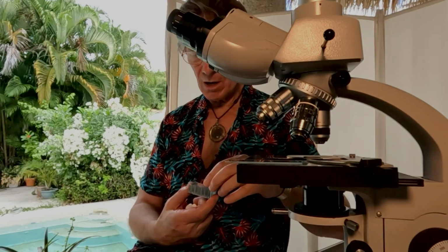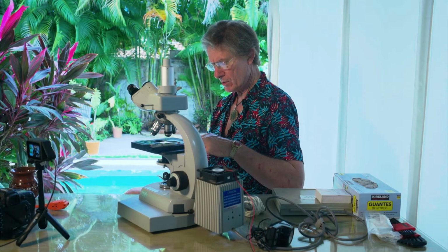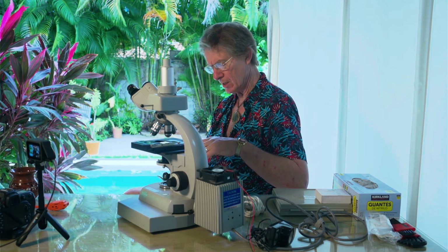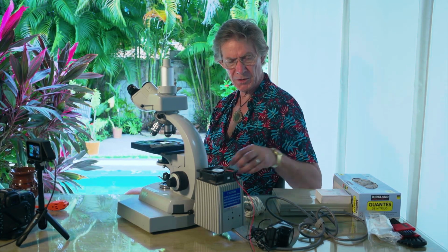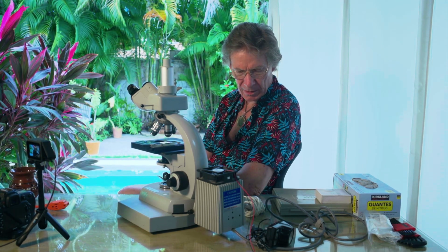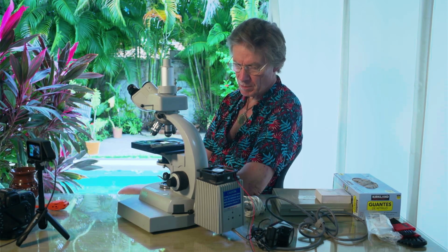And it goes on. Once the drop of blood has been put on the microscope slide, we put the cover slip onto the drop of blood, and then the drop of blood spreads on the slide very thinly, we hope. And there are issues that we teach in the course on how to make sure that the blood sample spreads properly so that we can evaluate each and every individual cell properly.